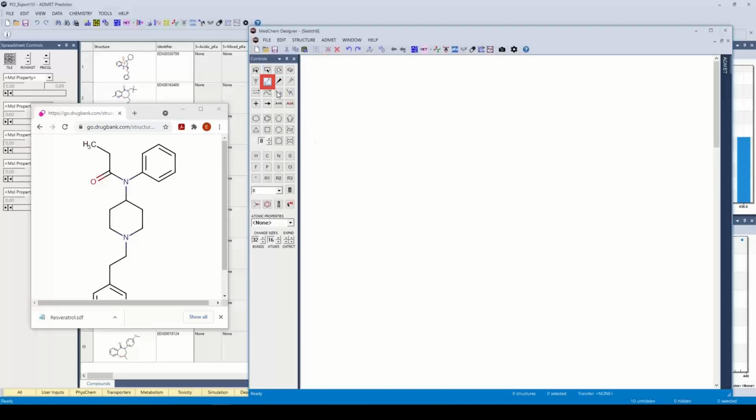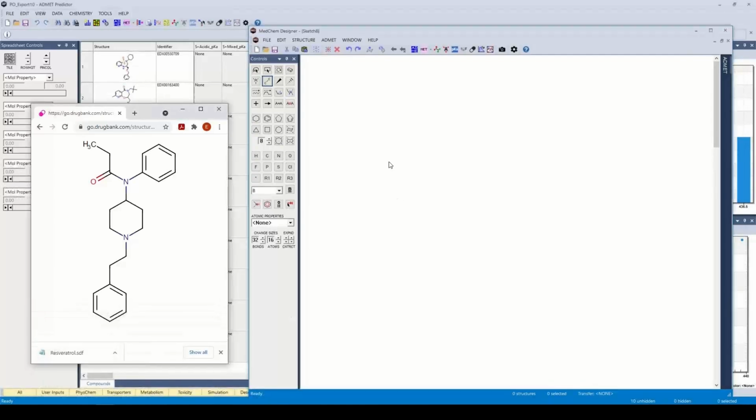So we would start by building the carbon backbone. Maybe put it in full here. So first carbon, second carbon, third carbon. Now we're going to bring a cyclohexyl ring. We'll worry about the heteroatoms later.